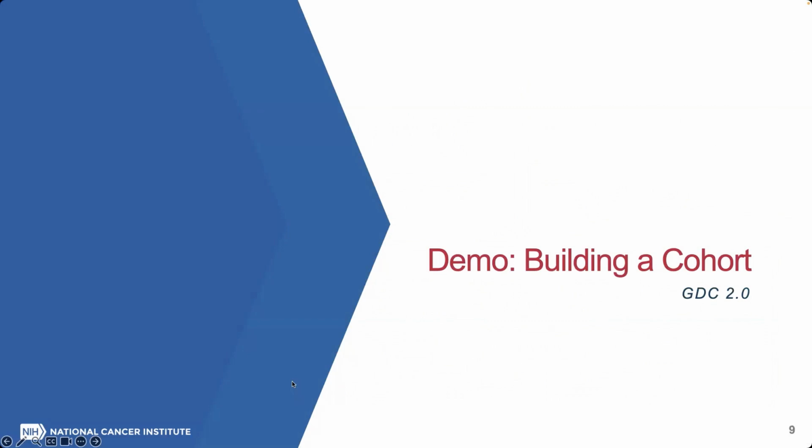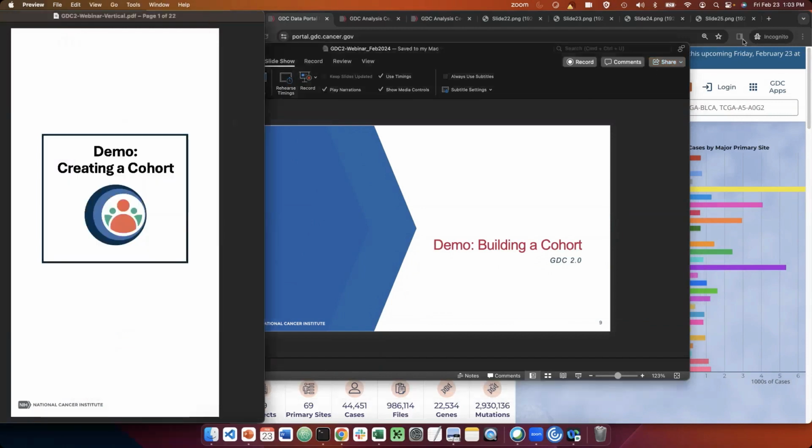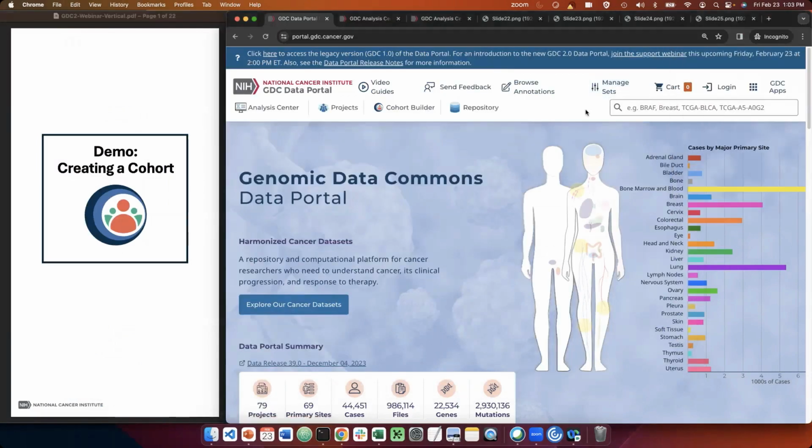So that's really the end of the introductory information. Like I said, this is going to be a mostly demo presentation. So let's go over to the actual portal and take a look. So here we are at portal.gdc.cancer.gov.